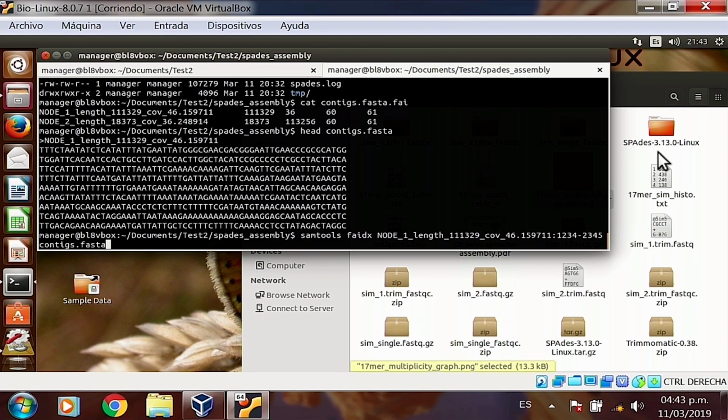That's the minimum information I need to give. If I don't say where this command should find the sequence, it will throw an error. If I don't say it has to be in contigs.fasta, or if I use the wrong FASTA file, for example, a FASTA file from another assembly that doesn't contain this exact sequence name, you'll get an error. So if you want to access that, you just press enter.